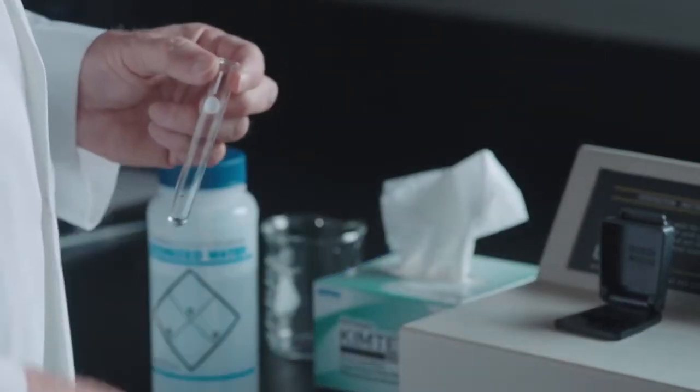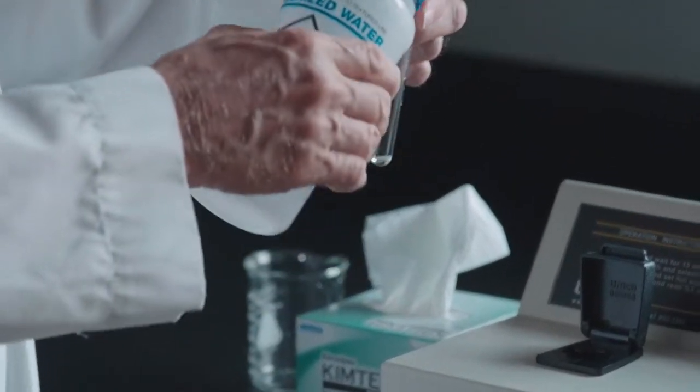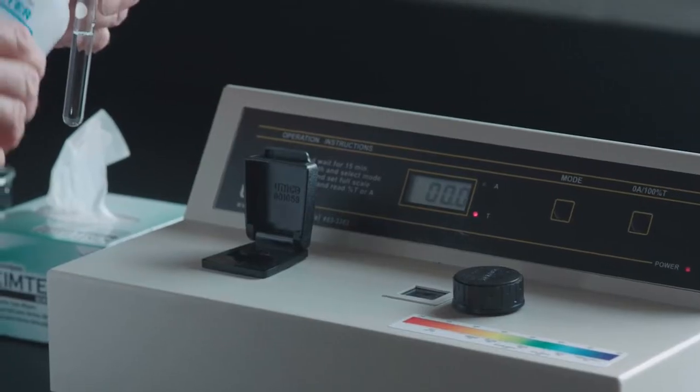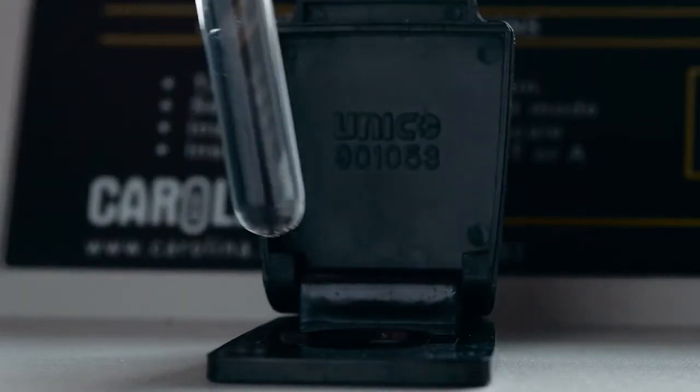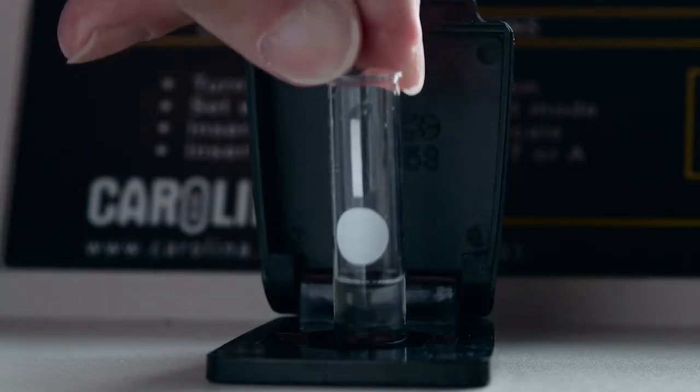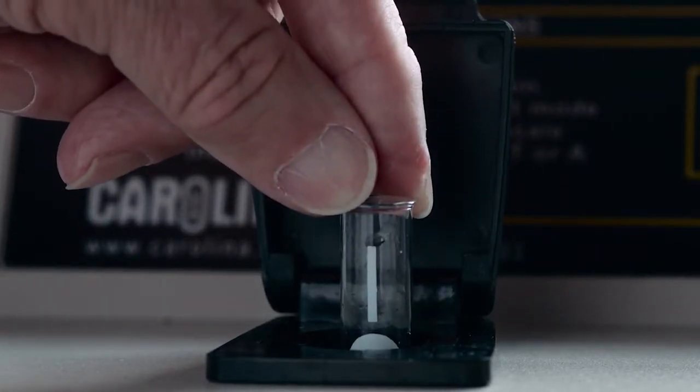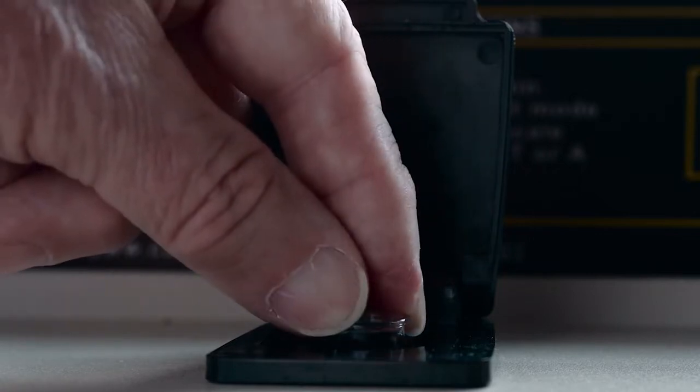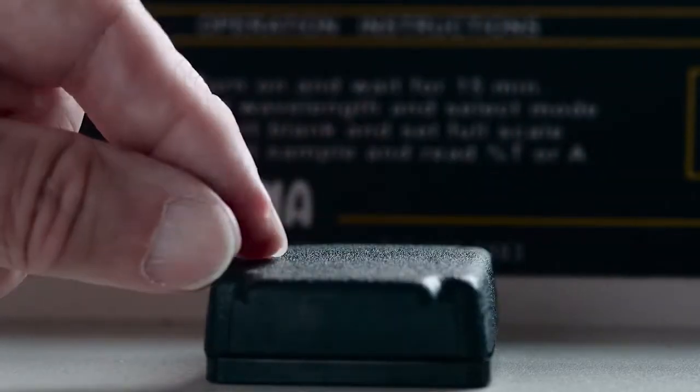It is widely used in analytical chemistry for various applications including the quantification of chemical compounds, drug concentrations, pollutants, and biomolecules. The accuracy and precision of the standard curve are crucial for obtaining reliable and reproducible quantitative results.